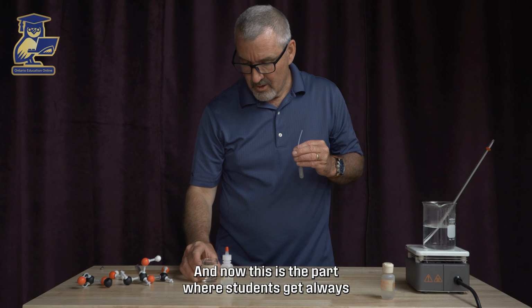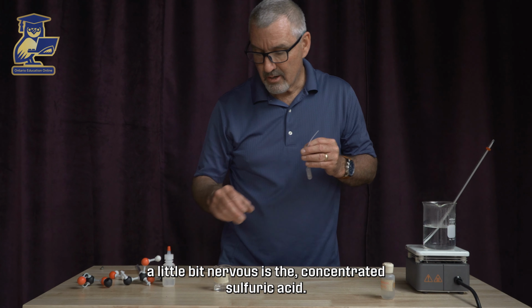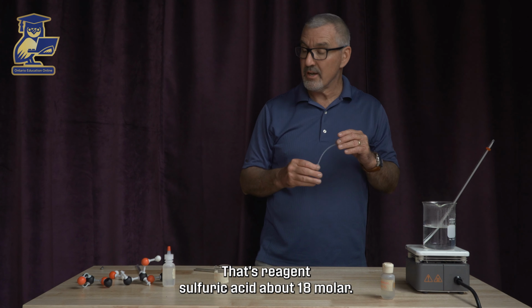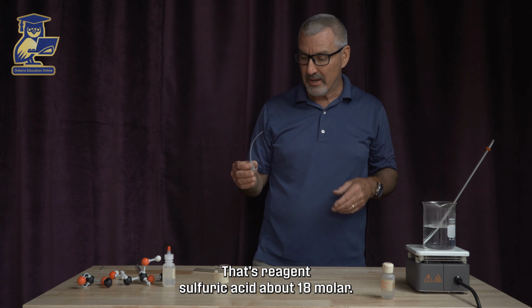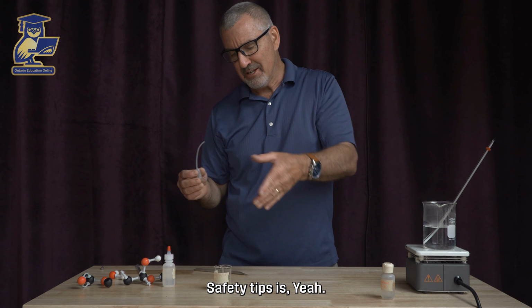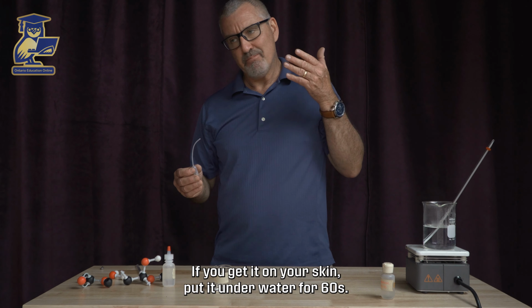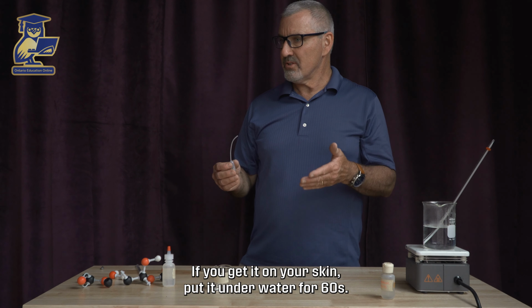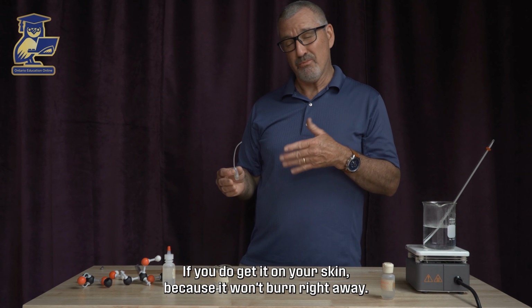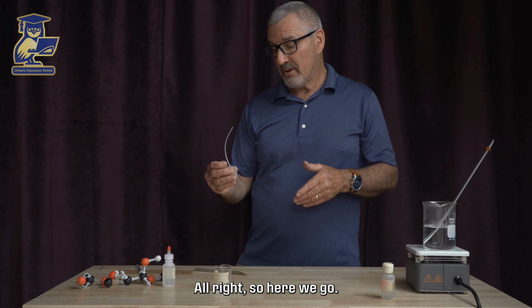And now, this is the part where students always get a little bit nervous, the concentrated sulfuric acid. That's reagent sulfuric acid, about 18 molar. Just a couple of safety tips: you don't want to get this on your clothing. If you get it on your skin, put it under water for 60 seconds, because it won't burn right away. But if you get it on your clothing, you'll ruin your clothing.